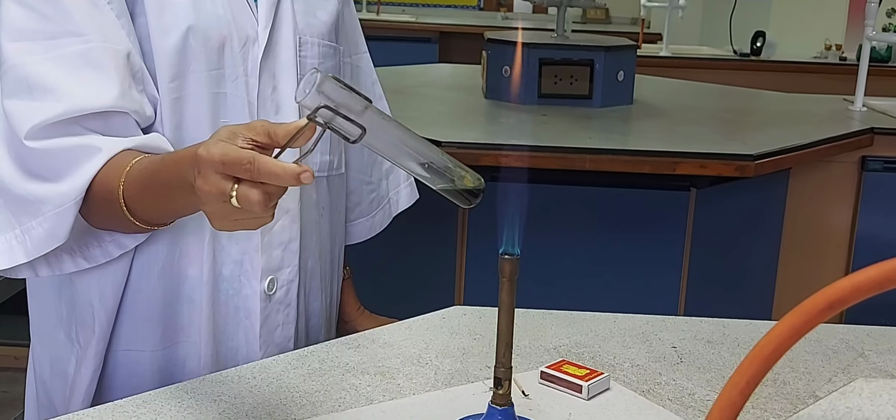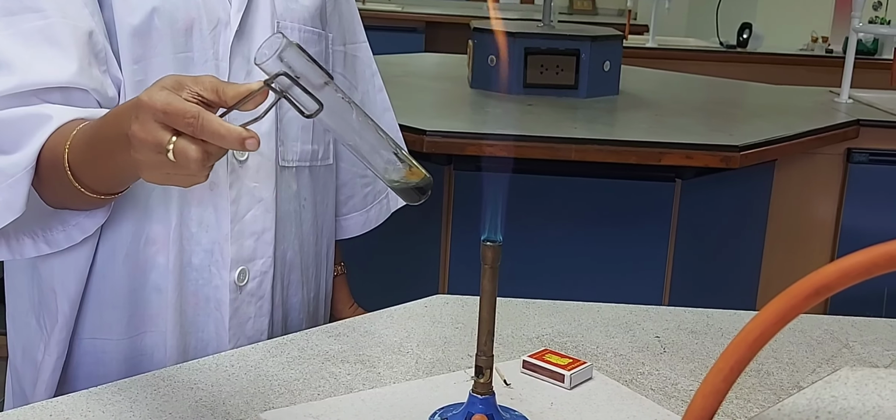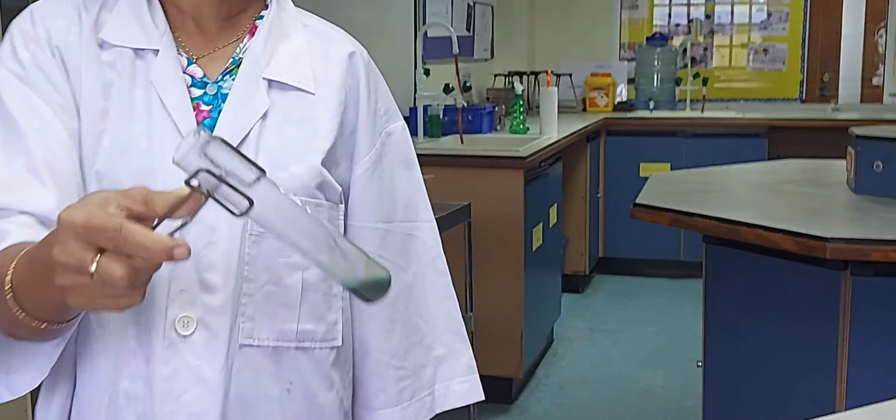Vapors of water formed. Yeah, and you can see that the solution has become blue.